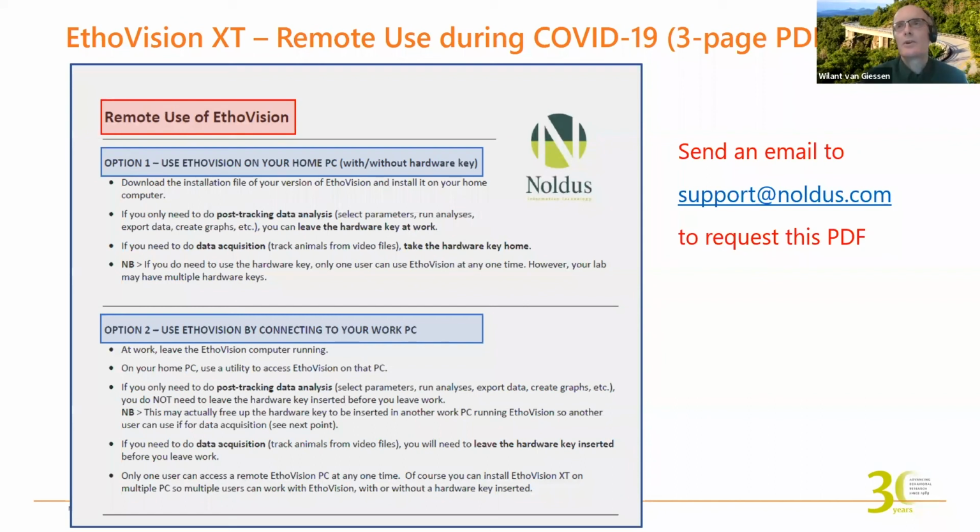Well, this is more of a gut instinct thing: you don't want to change horses in the middle of a race. You want to be as consistent as possible there. Now, if it's a study that goes over years and you have to repeat it next year, then maybe in between you can upgrade to the next version.